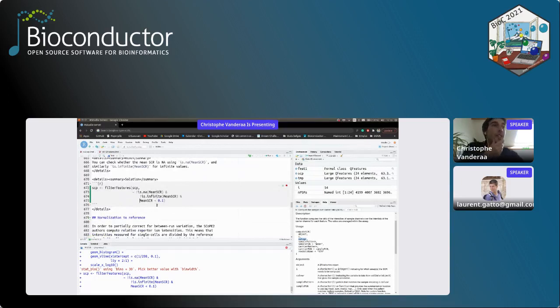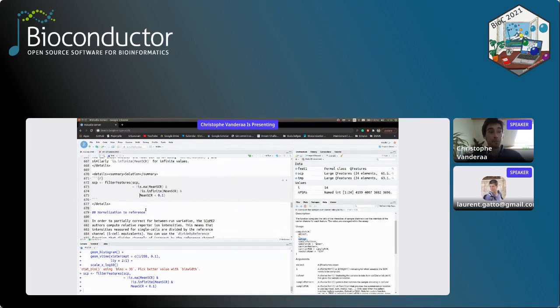Okay, so that's all for the PSM filtering. I hope it was interesting. I'm pretty sure some of you might have other ideas. How could we filter PSMs? And I think there are still great developments that we could do on how we can see which PSMs we keep, what's wrong, what's right. And I think this quality control at the beginning is very important and can still be improved, of course.